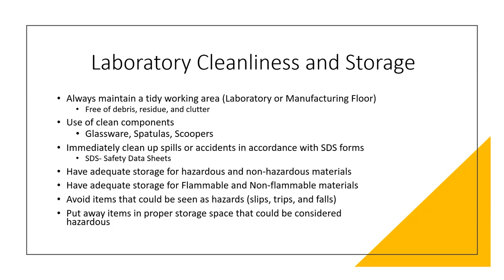We want to make sure that we're protecting samples or reagents from contamination, which will assure the most accurate results. So, having adequate storage for hazardous and non-hazardous materials, flammable and non-flammable materials is very important. There are special cabinets that hazardous and non-hazardous chemicals are put into. And we want to make sure that we are not overfilling those cabinets and that they have room to spare between bottles or between cups, things of that nature.